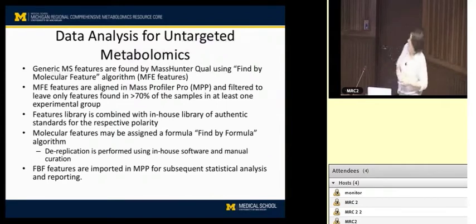I was going to put in a slide about what ppm means, but it's the width in which you are considering two things the same mass. So if I have a very stringent criteria the first time around, I might widen that out, and then it will go back and say, okay, this one has the same retention time, but instead of being 0.001 Daltons away, it's 0.002, and I'll consider that to be the same ion on the second pass.